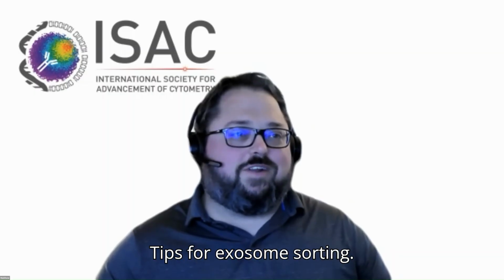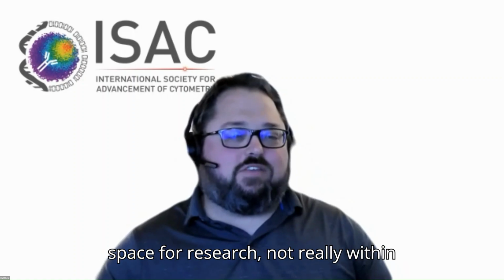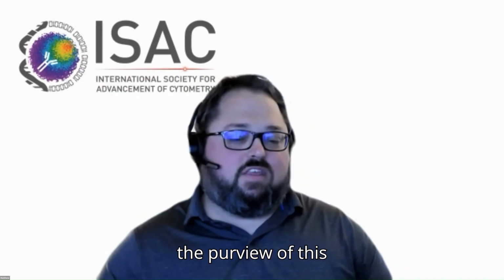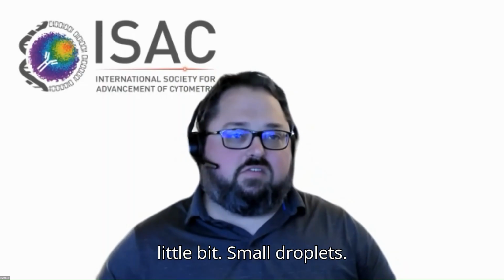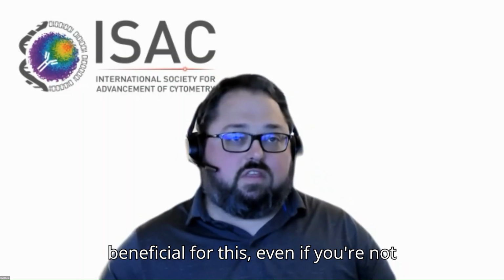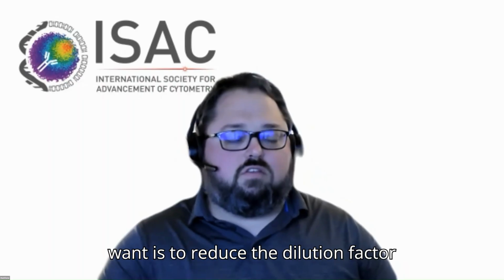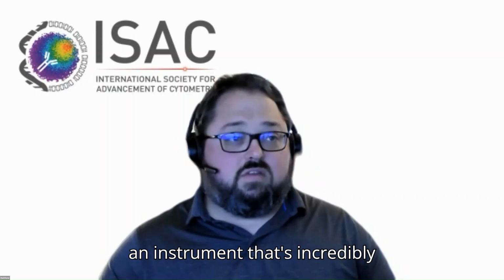Tips for exosome sorting. This is an interesting space for research. Not really within the purview of this presentation, but I can touch on it a little bit. Small droplets, obviously small droplets, small tip size, and high frequency are going to be very beneficial for this, even if you're not running them very, very fast. What you want is to reduce the dilution factor associated with the sort. You also need an instrument that's incredibly sensitive.